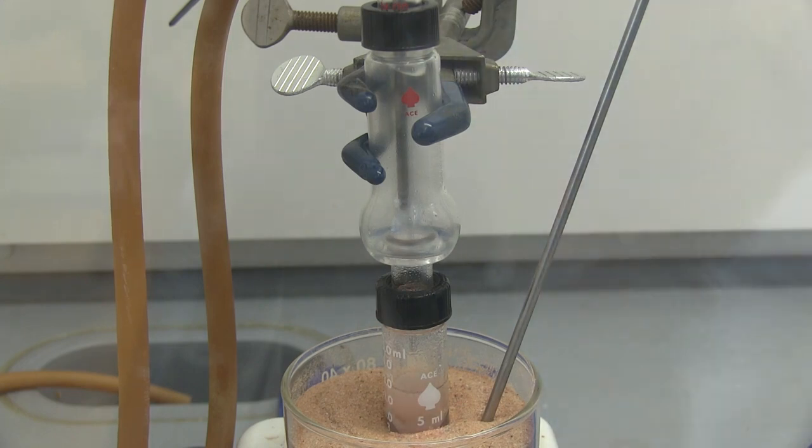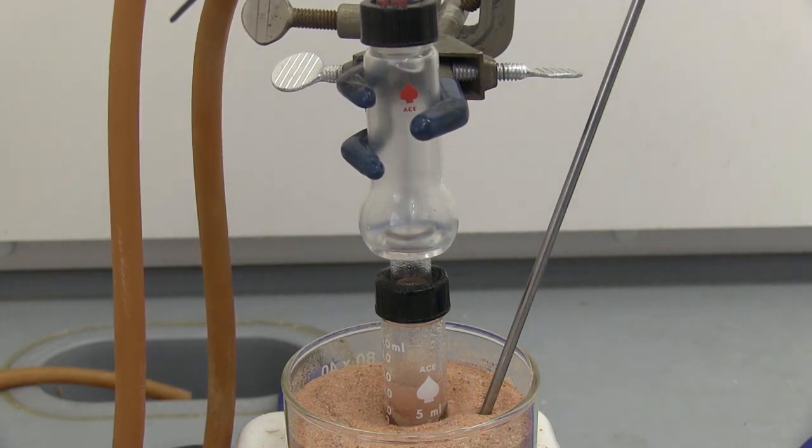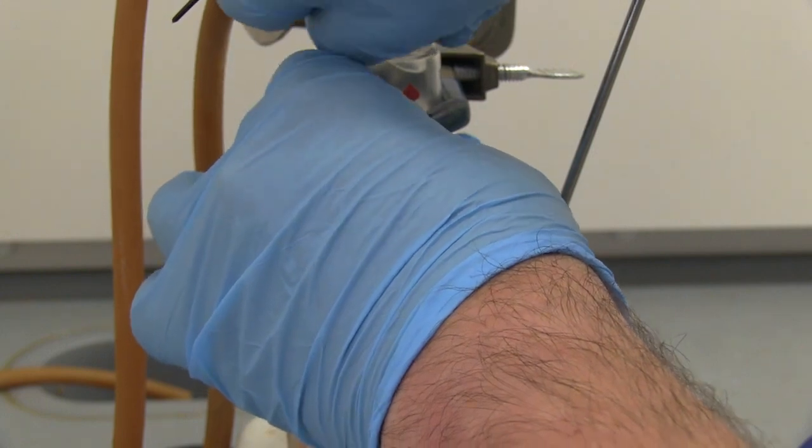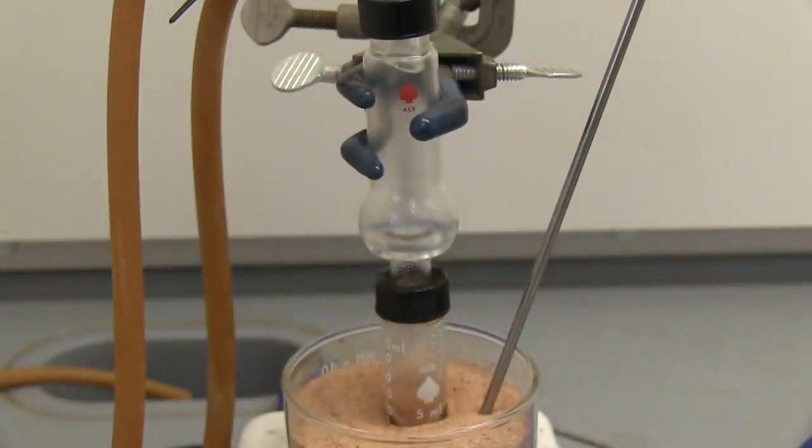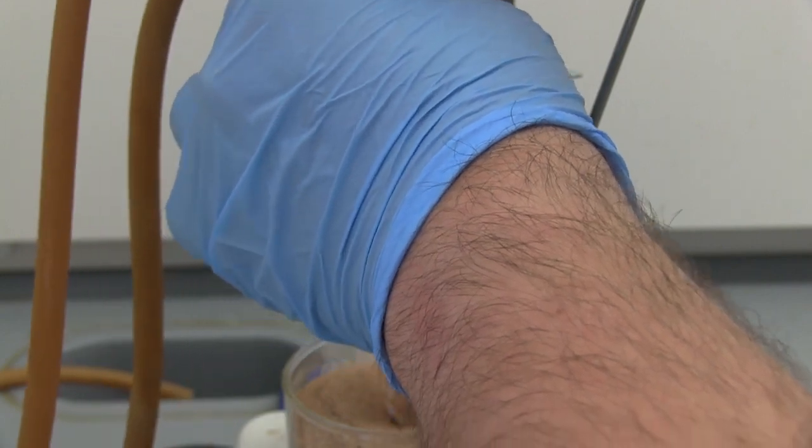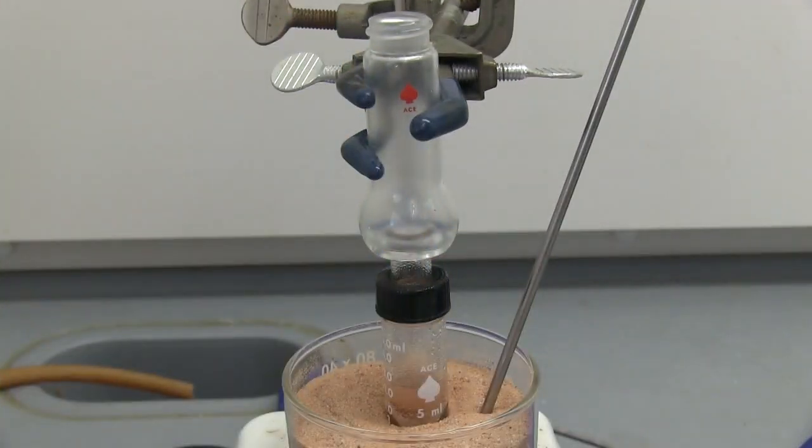Looks like we have enough liquid in there, so I'm going to go ahead and make sure the heat's off all the way, and raise up, take our thermometer out, and get it to the side. Turn off our water, and disconnect the water condenser. Lay it off to the side, and we'll drain the water out of it in a moment.